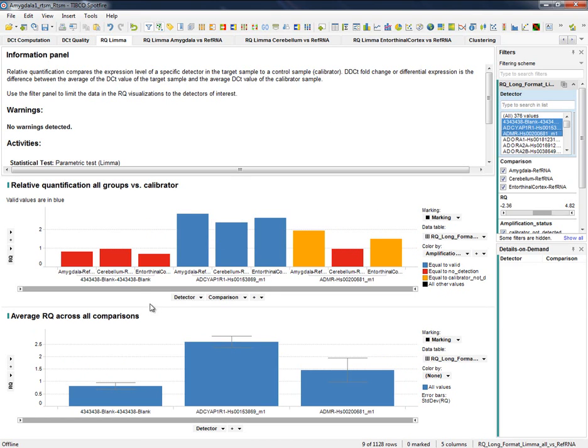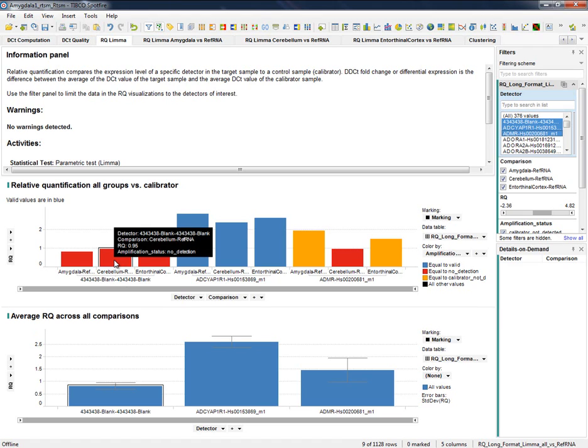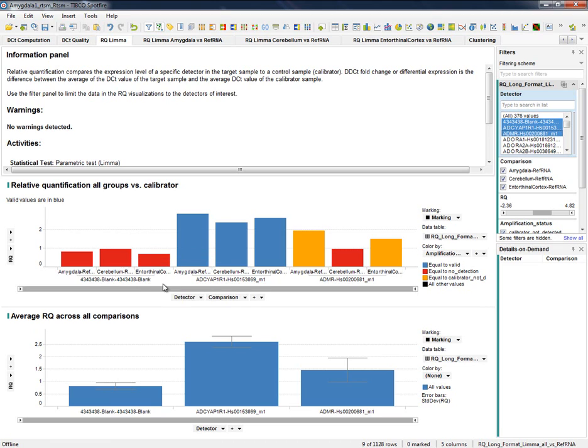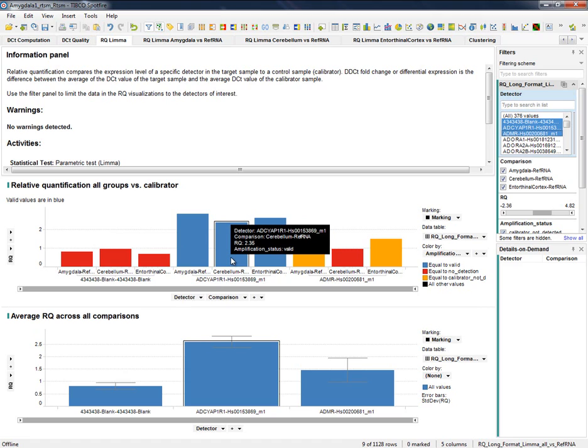The colors indicate potential flags in the expression level of the groups that we are comparing. For example, red color alerts us to the fact that the expression values of these groups, amygdala, cerebellum and control are very low so we should not rely on these results. Blue ones indicate valid RQ comparisons.